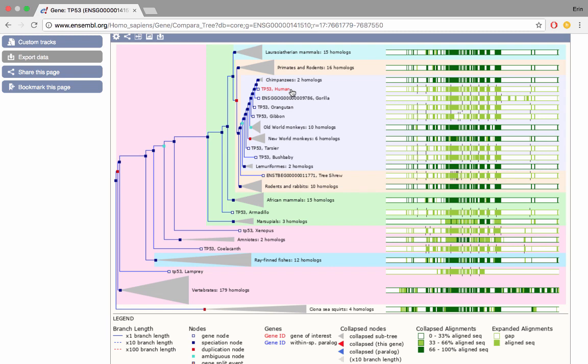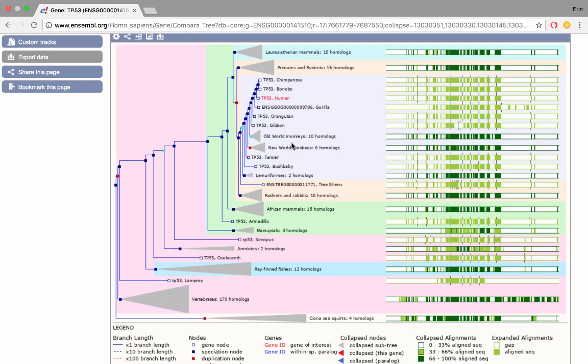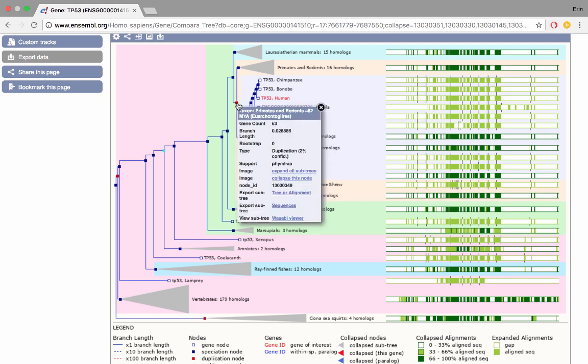A number of nodes have been collapsed as you can see by these grey funnels but we can expand them if we were interested. If I click on the node here this brings up a pop-up which tells me about how many genes were in that node that's been collapsed, so in this case two. What type of node this is, so speciation node here, and options to export the subtree or view it in other viewers as well such as Wasabi. I'm going to click on the expand this subtree option and you can see now that the chimpanzee TP53 node has been expanded and now shows both chimpanzee and bonobo. The color of the nodes indicate the event that led to that branch, for example a duplication or speciation event.